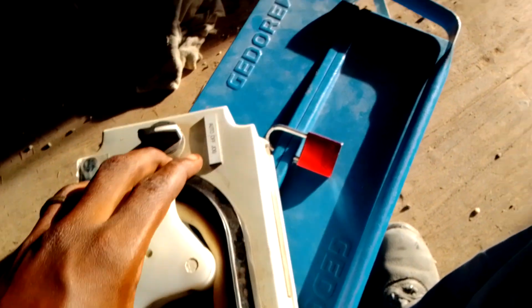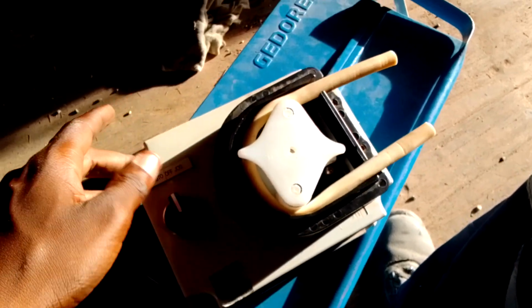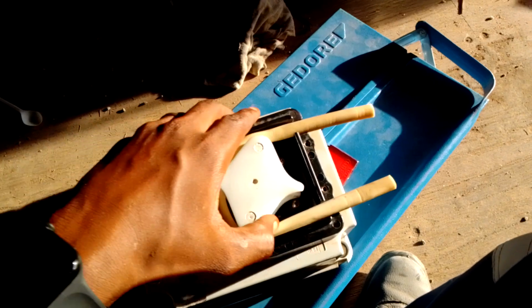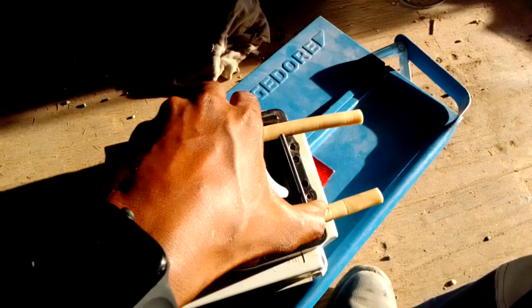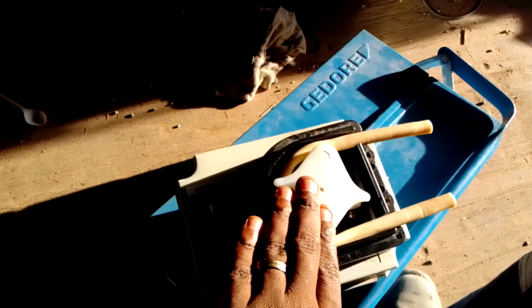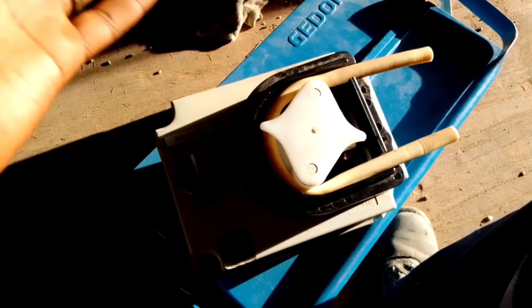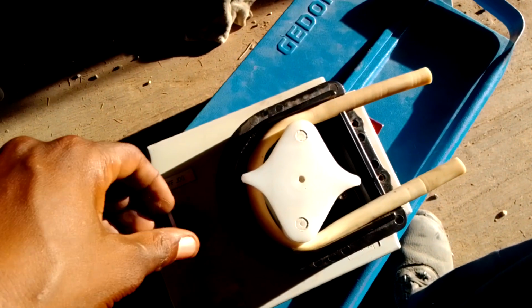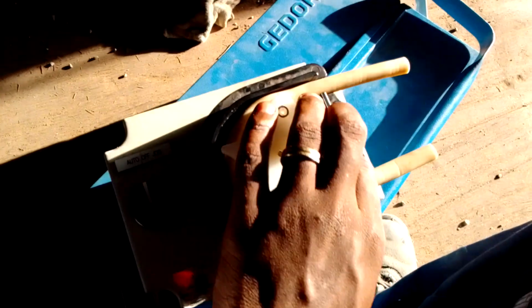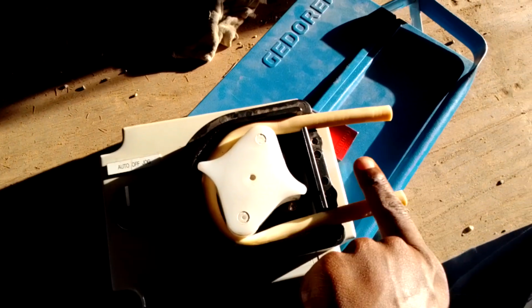So when do we use these pumps, right? Why wouldn't we just use a normal pump? Why use this particular version of a pump? Basically, you use peristaltic pumps when you want to pump a fluid that you do not want to come in contact with the pump's parts. Normally a lot of these pumps are made of metallic parts, and the fluid comes in contact with those metallic parts, or maybe the plastic parts, isn't it? With this particular version, the fluid does not come in contact with anything else but this pipe, right?